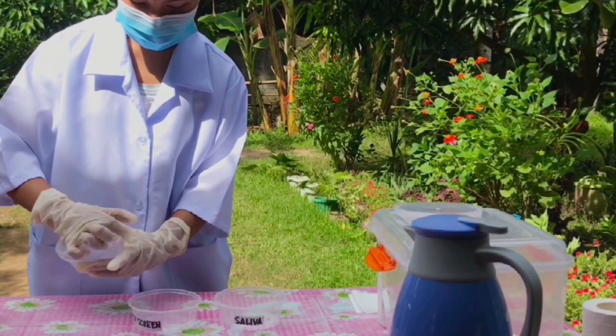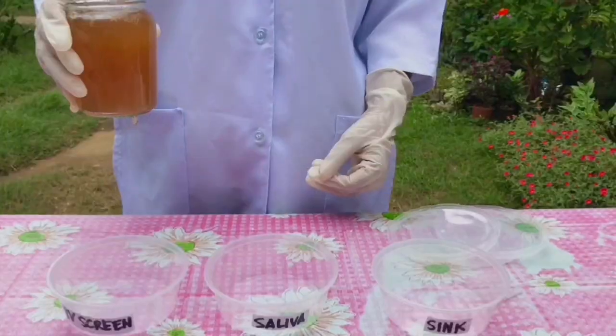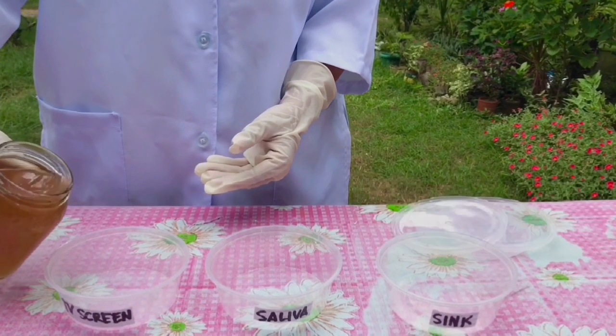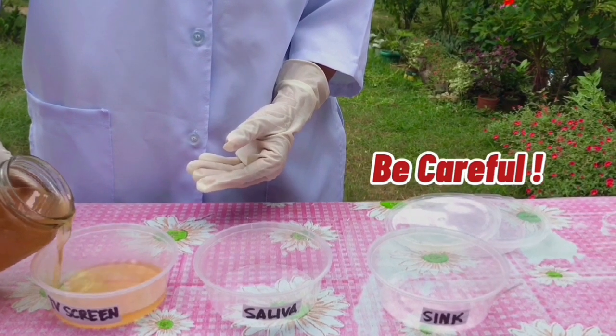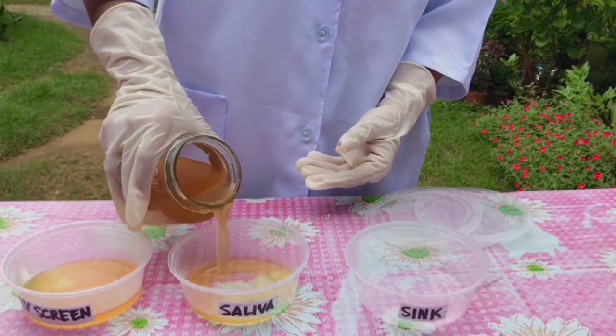Let our culture media cool for 3 to 5 minutes, and then pour it gently into the three Tupperwares provided as our improvised Petri dishes. Make sure that each Tupperware has a label.